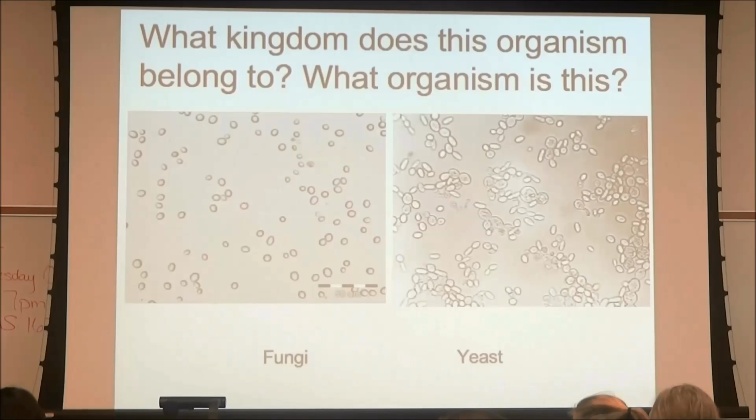There we go. Thank you, Violet. It has the nucleus. Okay, remember in lab, I said make sure you can tell apart the yeast from the coccus bacteria. And the sure way to tell is that the yeast has a nucleus.